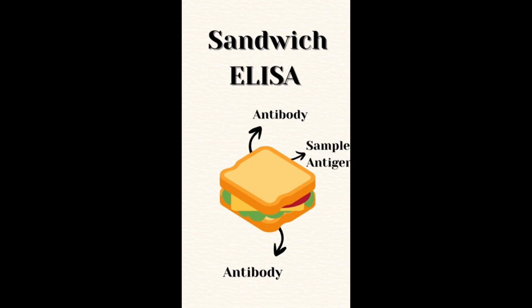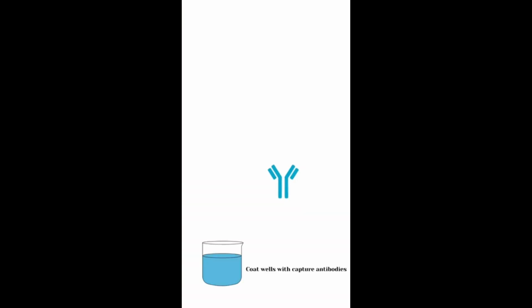So what are the advantages of the sandwich ELISA? It is highly specific, suitable for complex samples, flexible and sensitive. It has high flexibility and sensitivity.